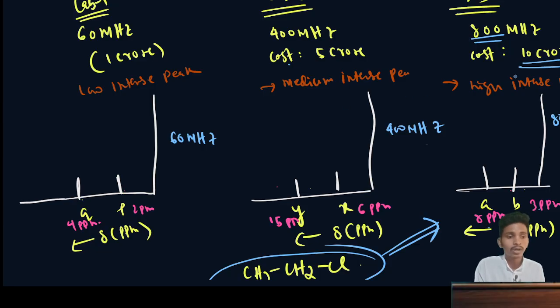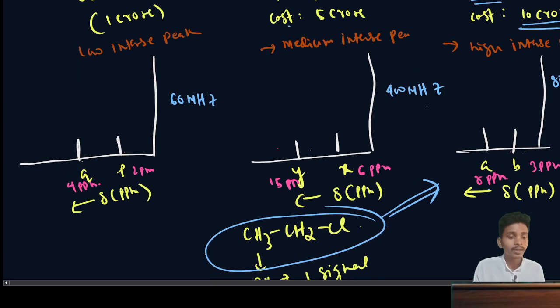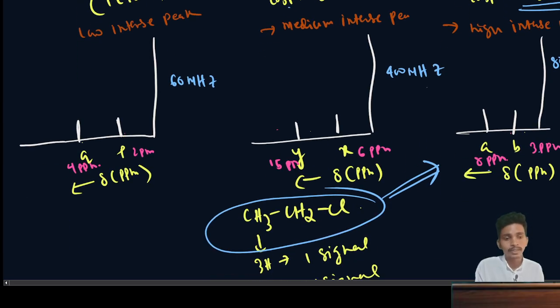So they will not all use the same instrument, and if they use different instruments in different labs, they will get different chemical shifts.